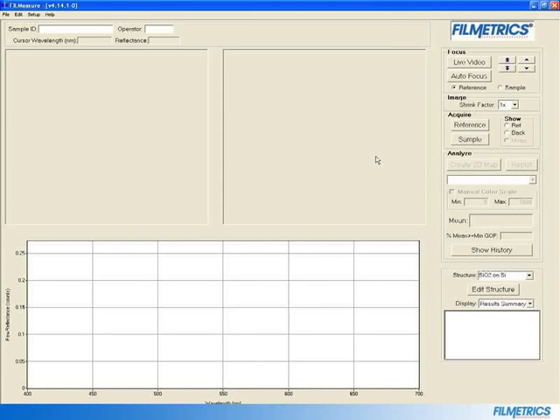Next, select the correct structure for your sample. In this case, we will be using the SiO2 on Si focus reference wafer provided with your system.